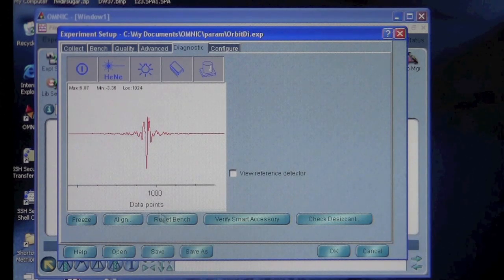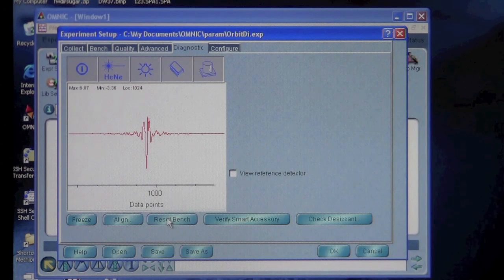Another thing you can do if the instrument is behaving oddly is click on Reset Bench, and it should reset the system and retest what accessory is loaded.